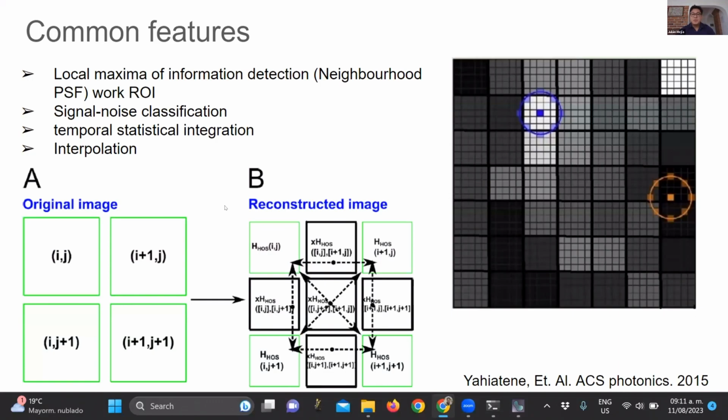So you have your image with an X and Y number of pixels, and then you increase the number of those pixels. I have a figure that tries to show that here. Picture that this is your original image, and then you want to subdivide each of the pixels into more pixels. In order to do so, you divide a pixel, and then you have to interpolate.